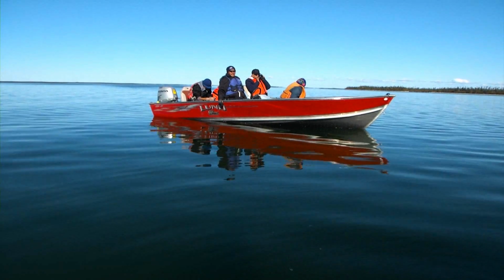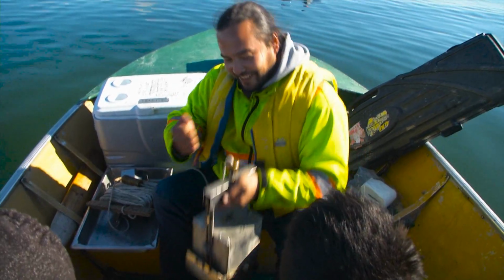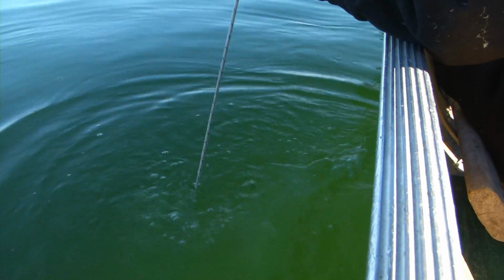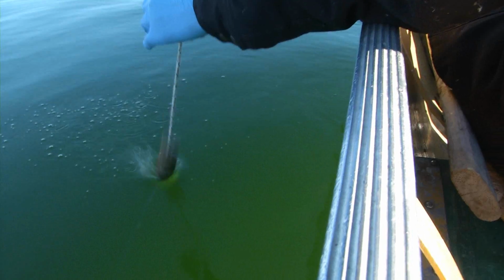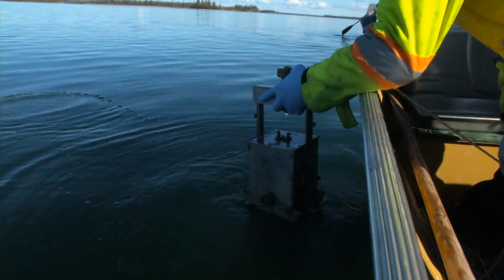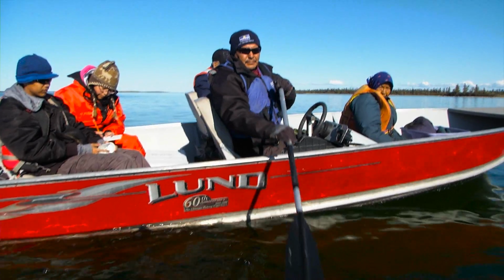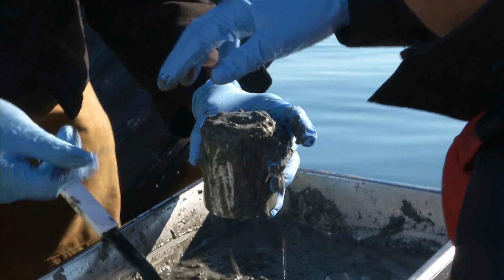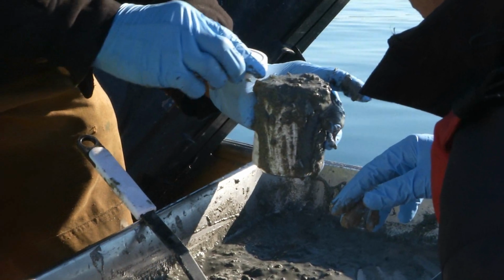When you're holding it up, don't put it on your knee because when it closes, it's gonna hurt. So lift that side, lift this one. This one is a sediment sample, yeah. When you fill it, you want to pack the jar so there's no air, and then just top it off. Good. Or even screw it closed like that and just wash the jar off in the water.